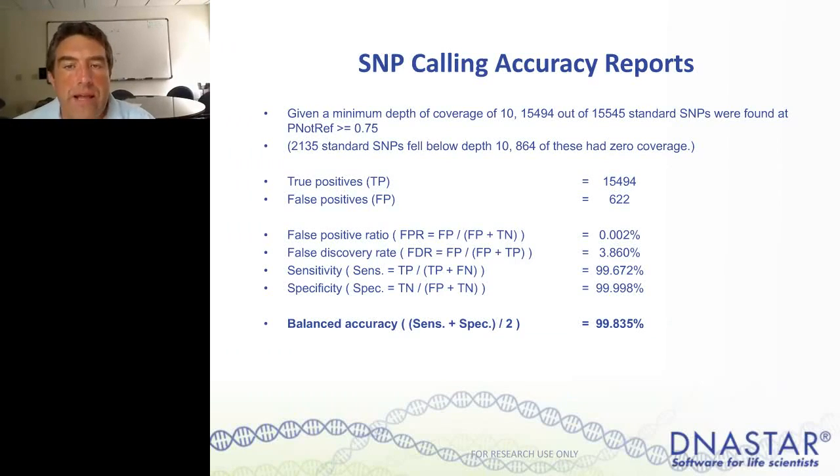When a validated standard is used, another report that's generated is the SNP-calling accuracy report. The accuracy report is generated from the standard that was used. So in this case, if it's the NIST NA12878 standard and you have a targeted region, our software can generate an automatic statistical report. This goes back to the accuracy claim that we have of 99.8%. This report will be generated in our ArrayStar software. So you run the assembly, say run validation report.